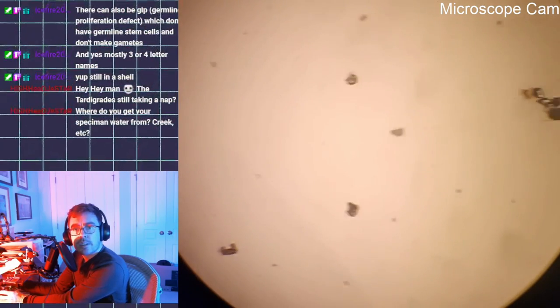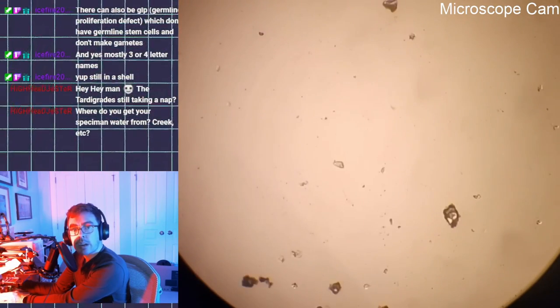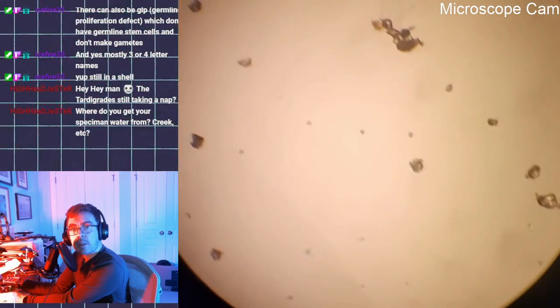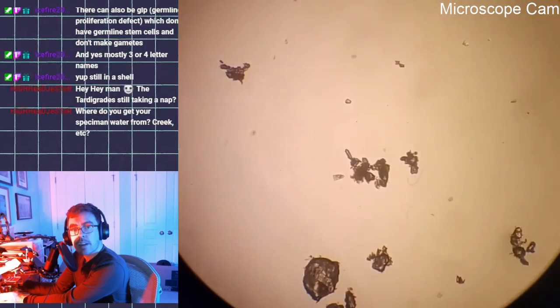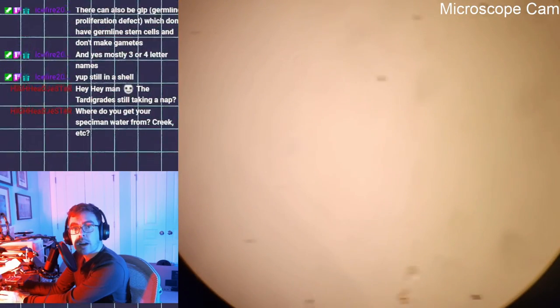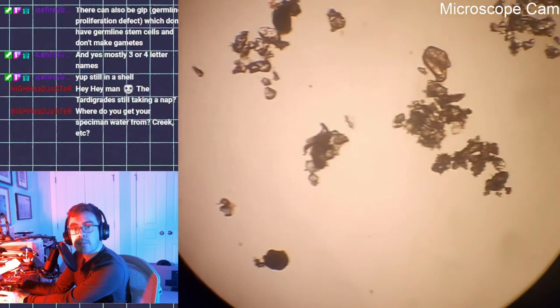So this particular specimen, so earlier I was looking at some roundworms, some C. elegans that were sent to me. This one, whoops, is originally from a nearby lake. But I've been culturing it on my desk for a while, pretty successfully. There's quite a bit of movement, quite a bit of life in there. I was just attempting to get this thing under the more high-powered objective. But I need it to stop moving.